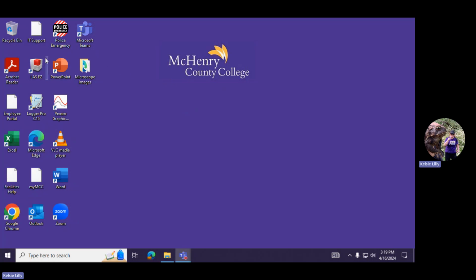We're going to do a 5 to 10 minute crash course here on some of the basic functions for our educational software. So I'm sharing the screen right now of McHenry County College, which has the Leica DM500 classroom set with the ICC50W camera. And we have it connected via USB to the computer so that we can access and use LAS Easy for the instruction of students.